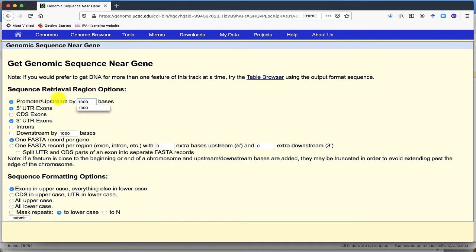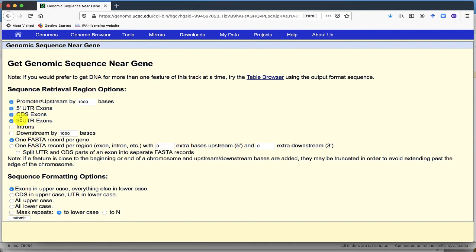So let's say, we want upstream sequences 1000, including the promoter, 5' UTRs, the exons, and UTRs, 3' UTRs.